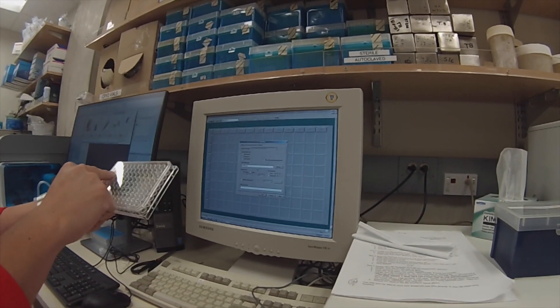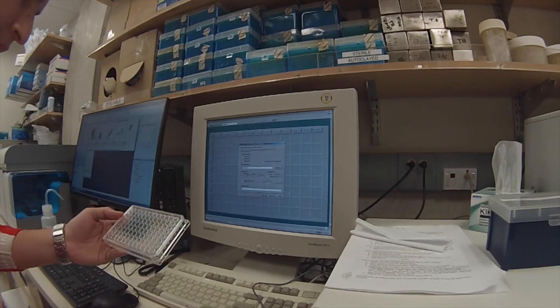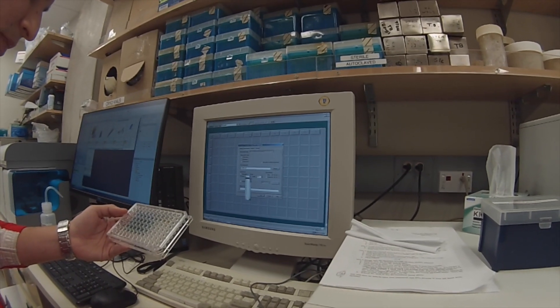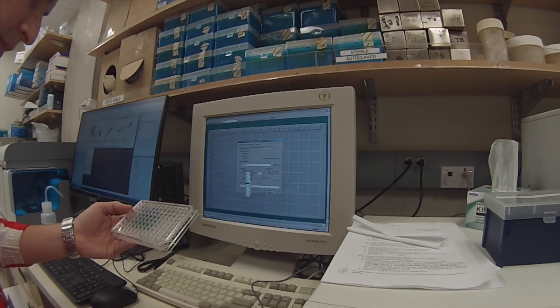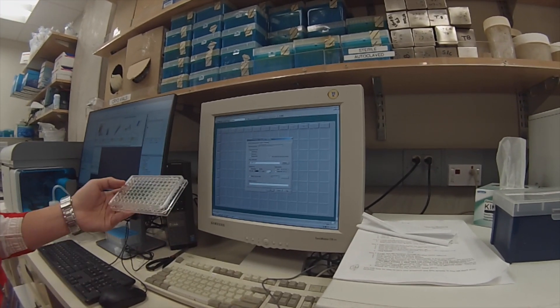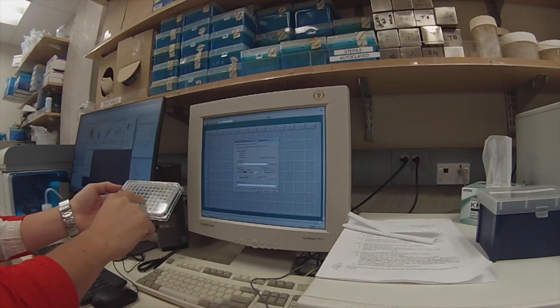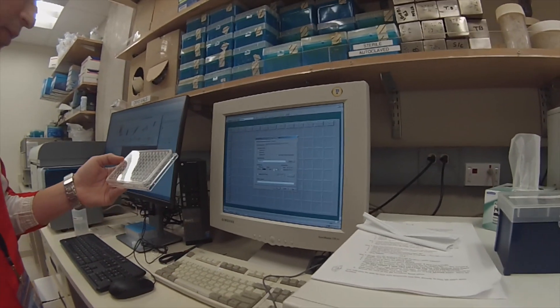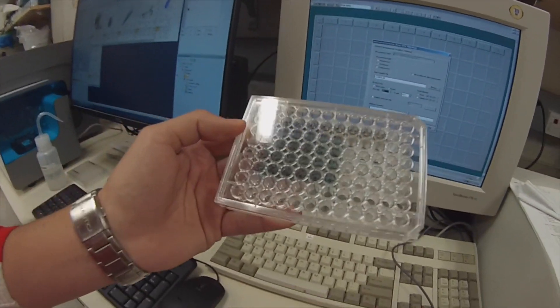We're going to set the range, which in this case is B2 to F10. Unfortunately we cannot eliminate these ones, but it will still save us a lot of time.